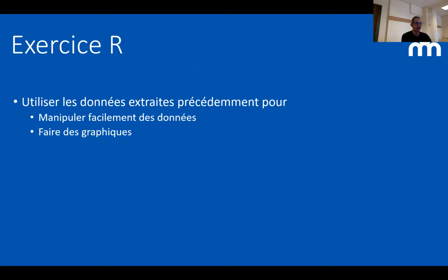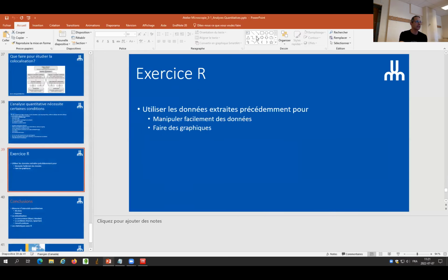Because the interface on the Séance is really the raw R, it might be useful to do it on my personal laptop. So I might use this to do the exercise example. I'm going to switch here, stop sharing, and move to my personal laptop.